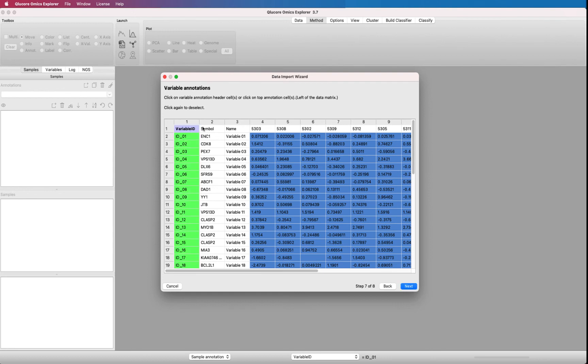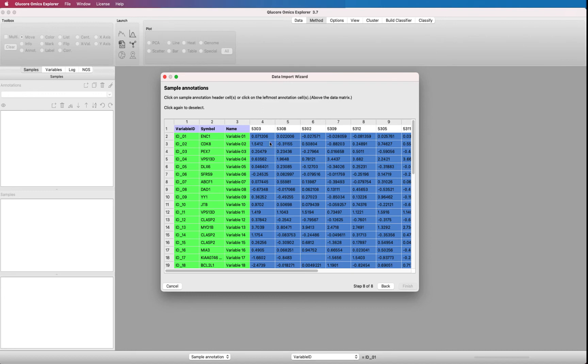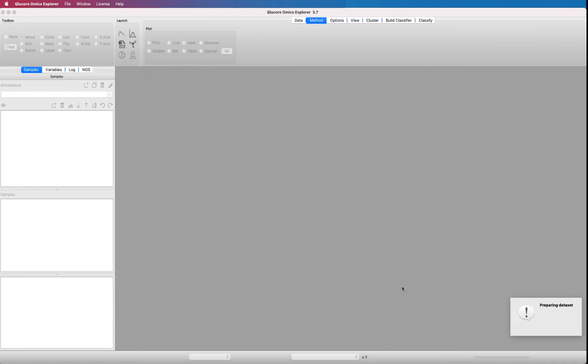When it's time to mark the samples, we mark the first sample direct link. Press finish.